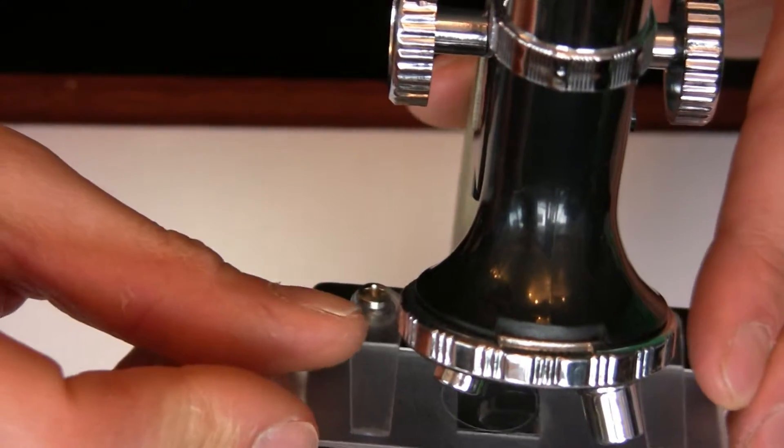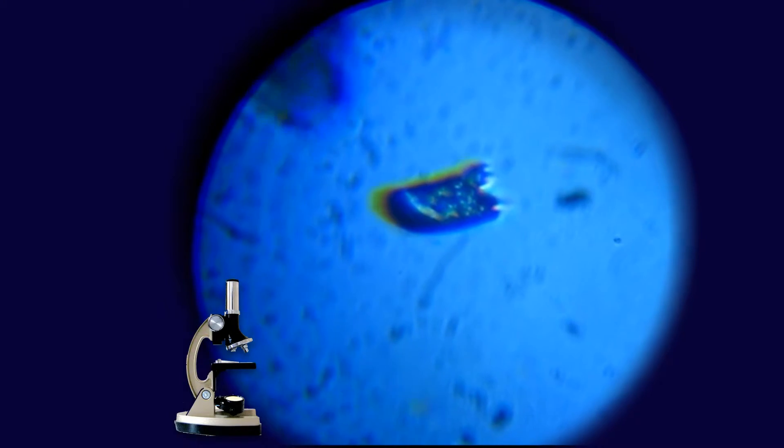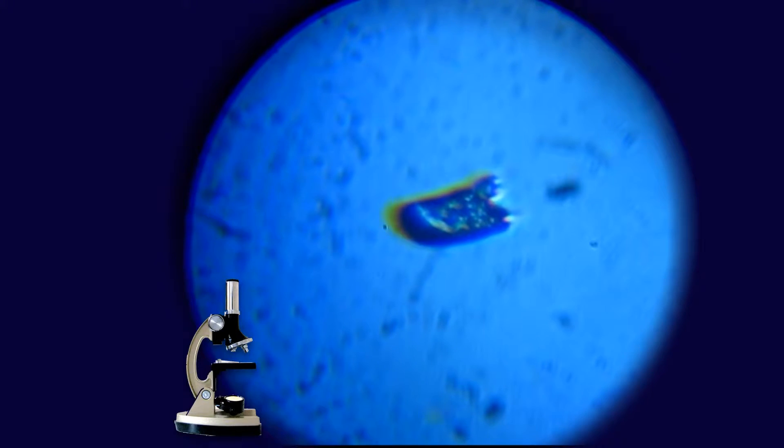Right, here's another slide and I've found a bit of stuff on this one. But look, something's just swum past. Now that is exciting. Right, gotta find that again.